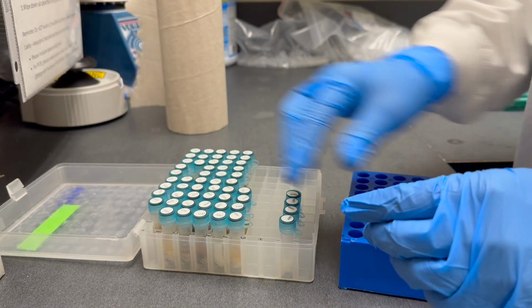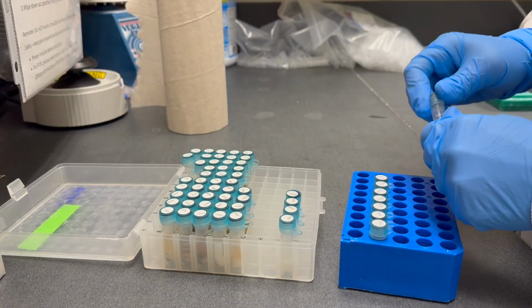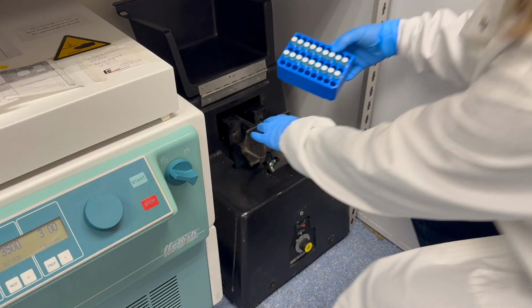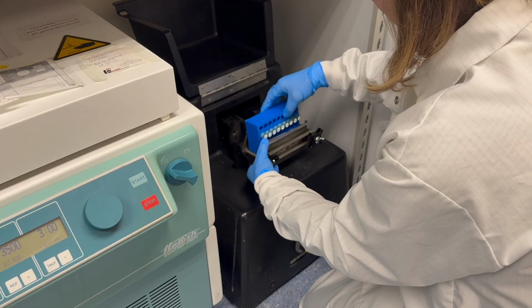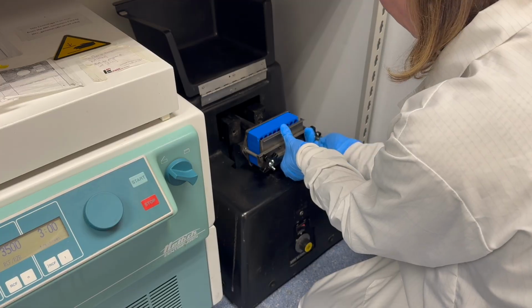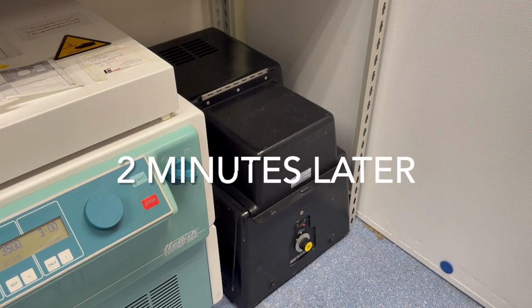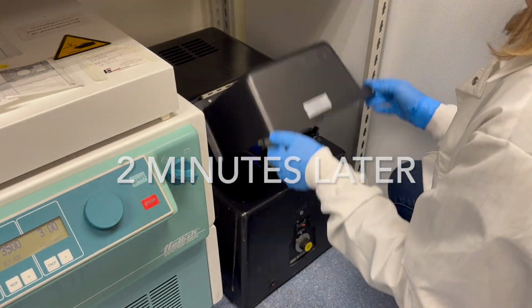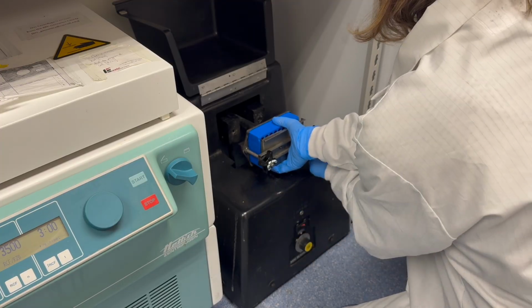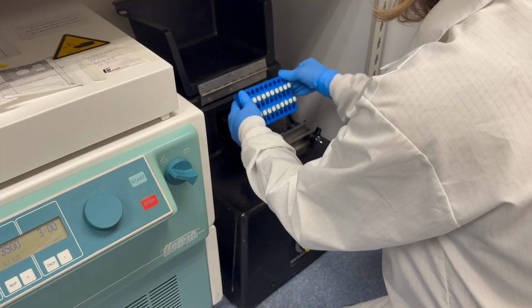So now we're back in the lab, and the first stage of the DNA extraction is to bead our samples. Those beads that we added to the tubes earlier are going to be shaken around inside the tubes, and that's going to break down any intact tissue and break down all the cells to release the DNA into solution. I bead my samples for 2 minutes, but you may want to use longer, for example if you're looking at the diets of insectivorous birds, because the tissues of those prey are going to be much harder to break down.